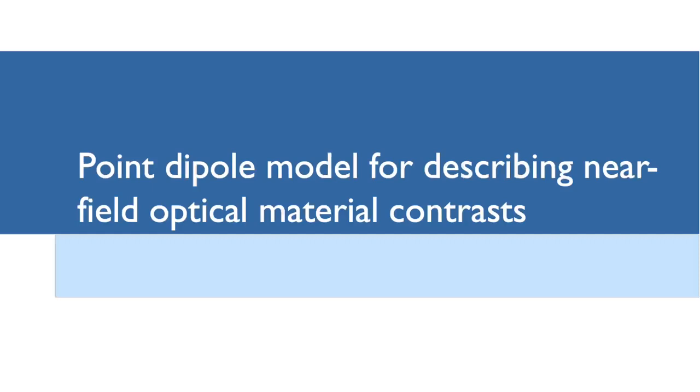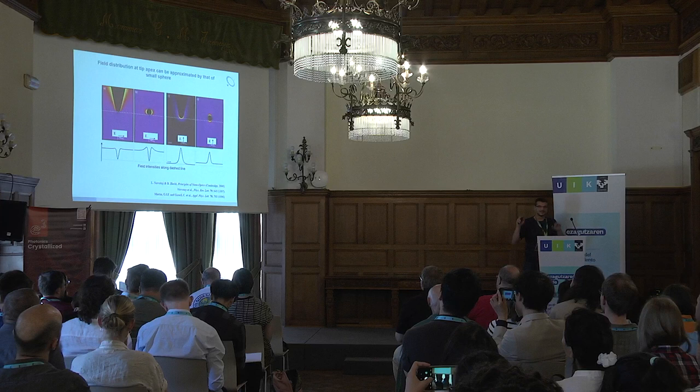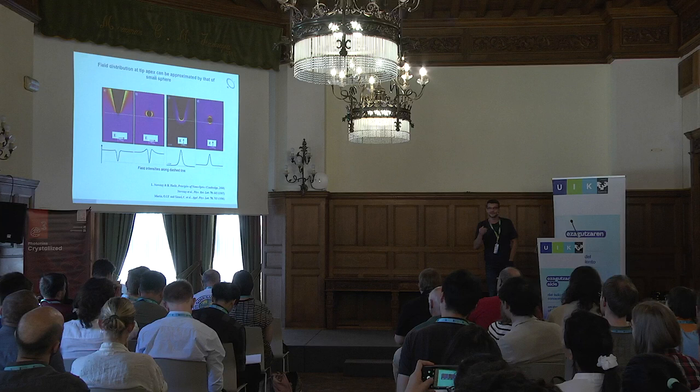So the next thing I wanted to talk about a little bit is the dipole model. So now a model: how can we understand it? So far everything was a little bit pictorial, and I want to illustrate now this dipole model that also comes from Fritz's lab, from Bernhard Knoll. Actually, he started to develop the first of these models.